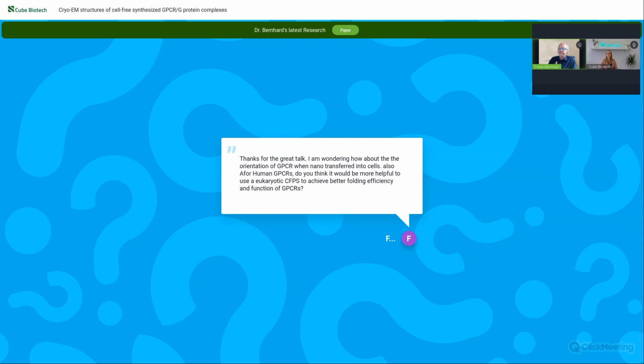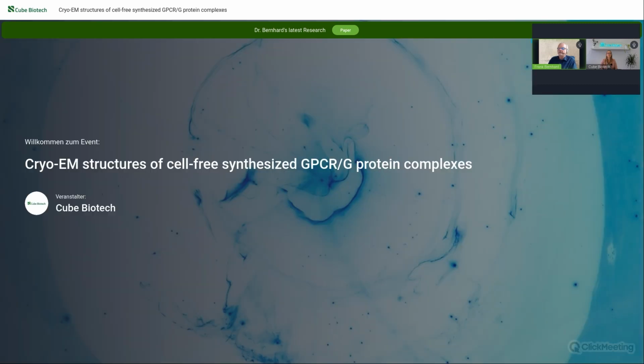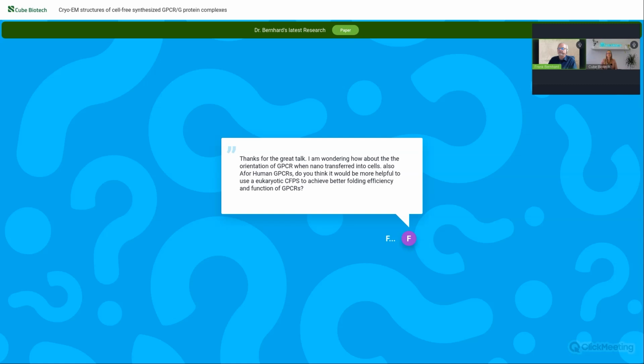So again, it's a G protein, so the Gq. We do not synthesize it in the cell-free system because the beta gamma, G beta and G gamma, are completely insoluble. For Gq, usually a fusion between Gq and Gs is used, but as we have to isolate G beta and gamma anyhow from insect cell cultures, we already isolate the complete complex.